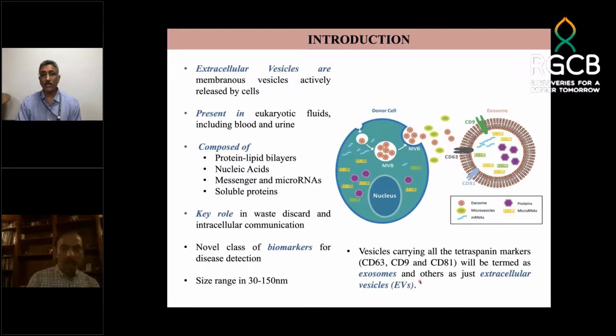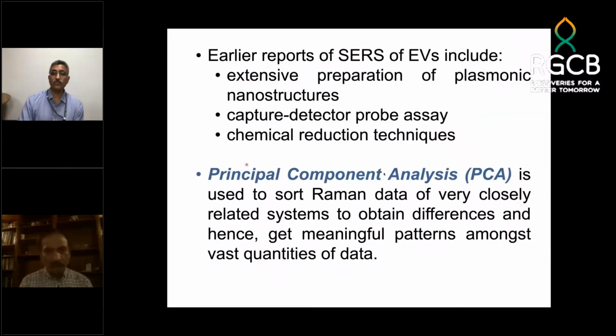Because EVs have similarity, we use something called principal component analysis, which is similar to what you do in flow cytometry and other such things, where we use this analysis to look at sorting of the Raman data.